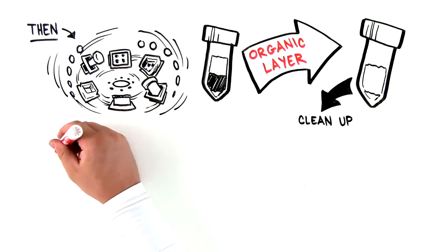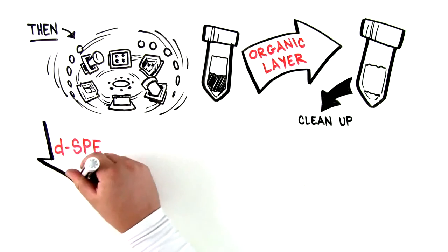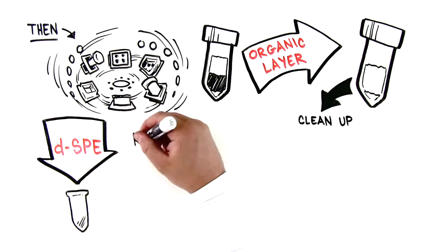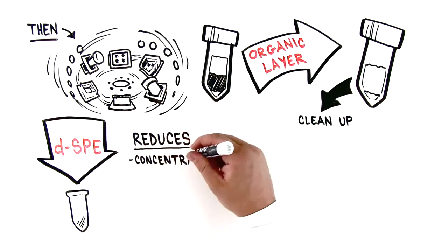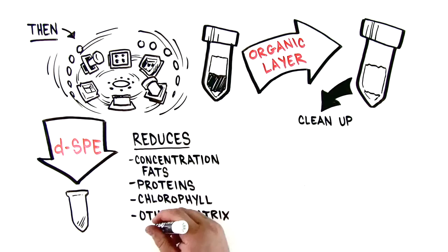Cleanup. In this final step of the QuEChERS workflow, add DSPE, or dispersive SPE, to the tube containing the organic extract. The DSPE step reduces the concentration of fats, proteins, chlorophyll, and other undesired matrix components.